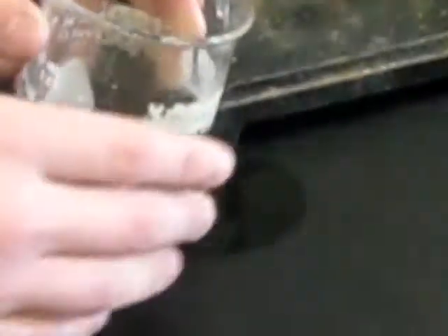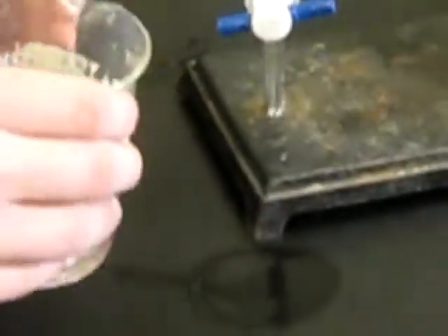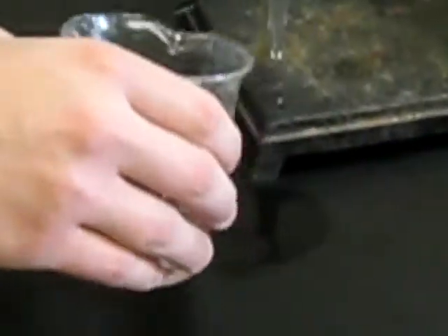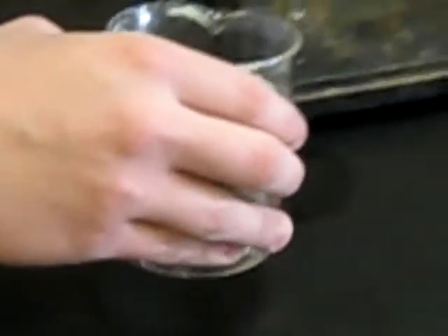What we're going to see here is that the acid should start to turn a light purple and then become darker as you add base, but you don't want it to become too dark, otherwise you've gone too far. What will happen is that pink color will fade as he swirls, but eventually that pink color will start to hang around and it'll get deeper. Once that starts to happen, we add 1 drop of base at a time until we get the color just right.